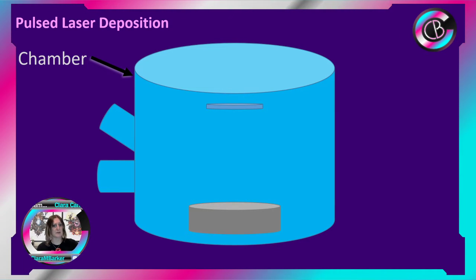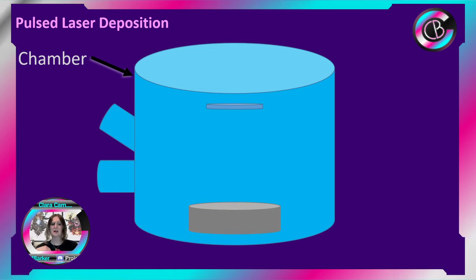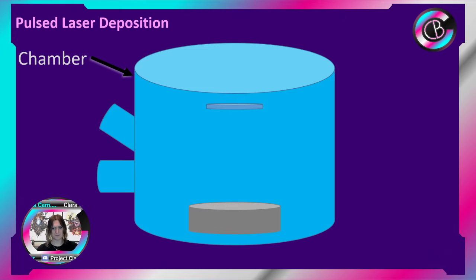alloy. So we could have titanium nickel, it could be an oxide, so we could have titanium oxide, and we can have various compositions. So we can have various lithium compounds, because we do a lot of battery deposition in our lab for lithium batteries. So we can have a material which is lithium based, and we actually have a chunk of this material.